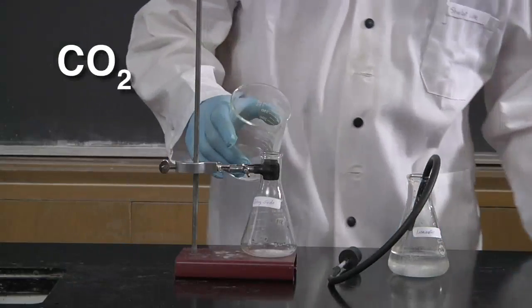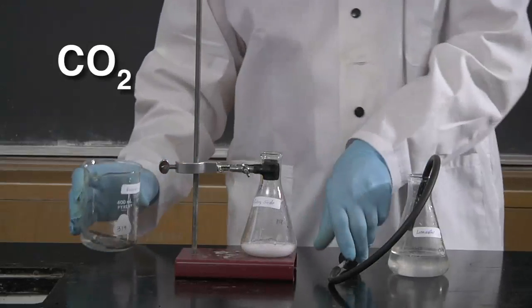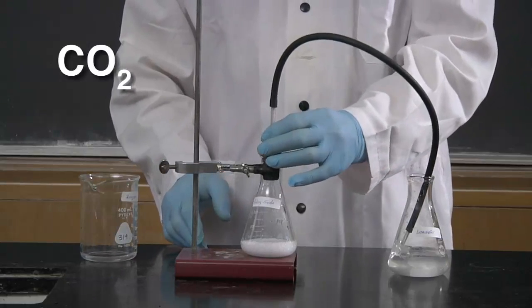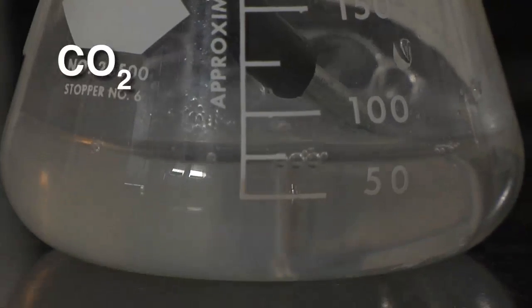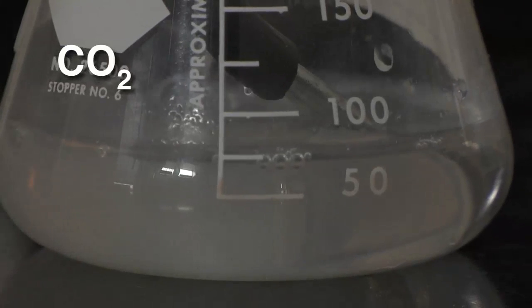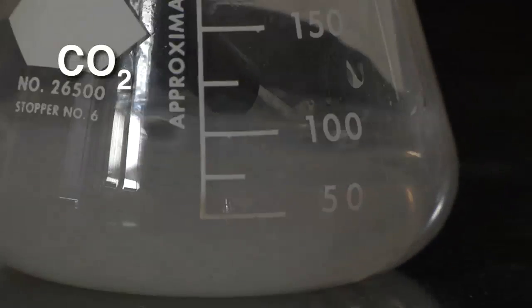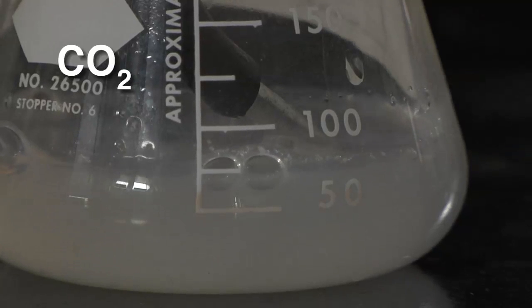A distinctive test for carbon dioxide is the lime water test. Add the stopper with the rubber tubing to the flask with the sodium bicarbonate and vinegar. Drop the other end of the rubber tubing into the lime water flask. Carbon dioxide enters the lime water and makes it cloudy. Students can use a test tube instead of an Erlenmeyer flask for this test.